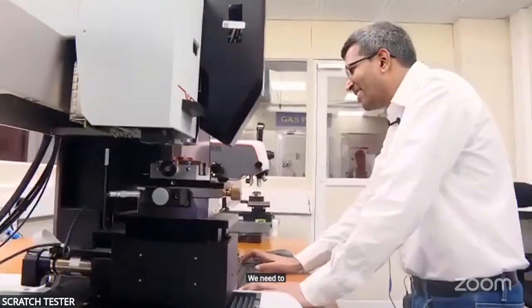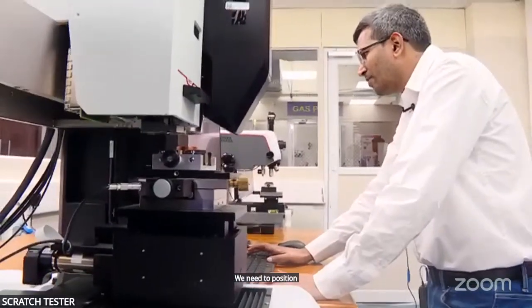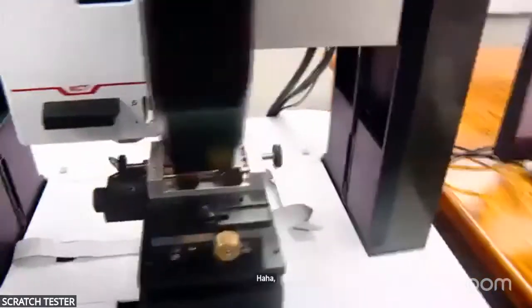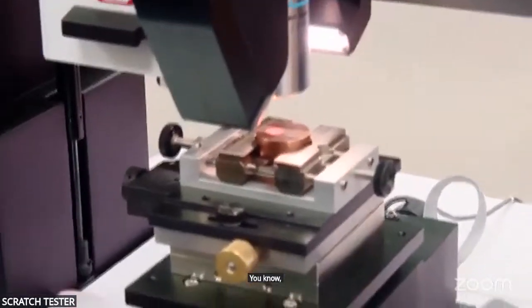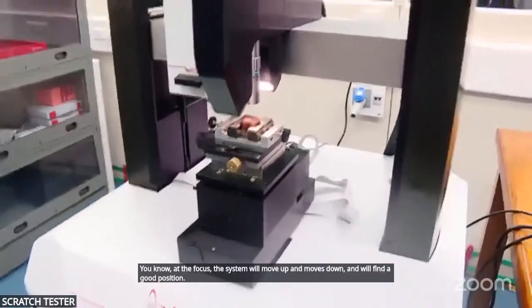We have side view and top view. We need to position the top view inside the side view, and then the system can do the automatic focus. How will it work with contrast? What if there's not enough contrast? The system can do it with contrast. You will see, normally it will do it. At the focus, the system moves up and moves down, and will find a good position.